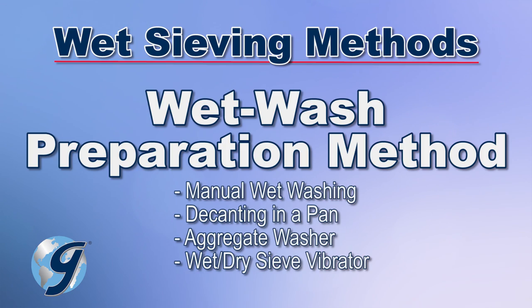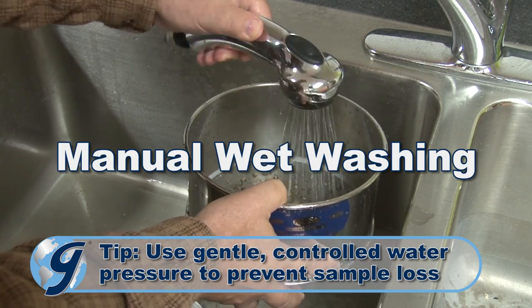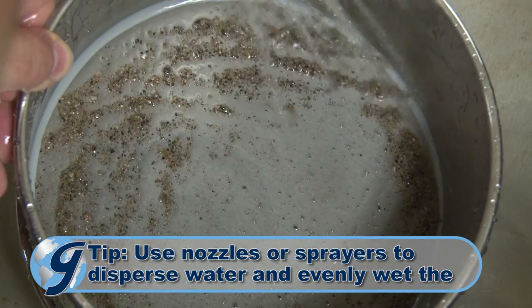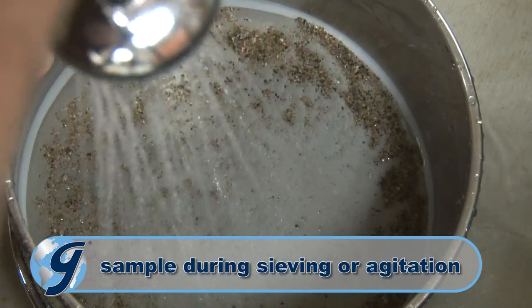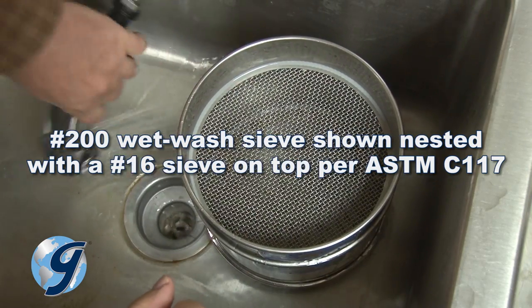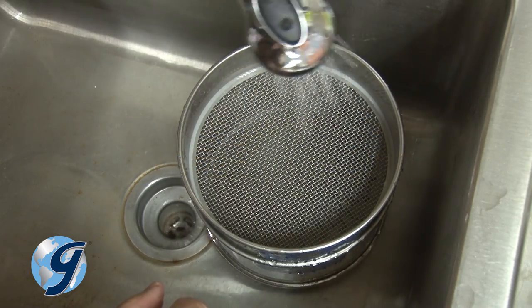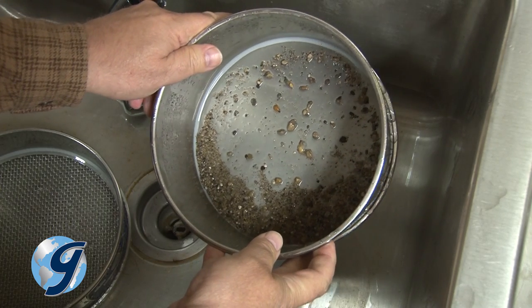The wet wash preparation method involves agitating the sample as it is sprayed with water or while it is in a water suspension. The agitation is often done by hand using a wet wash sieve under running water from a faucet or from a spray fixture. Mesh sizes for these sieves are selected based on application requirements. The number 200 and number 325 sieves are examples of popular opening sizes. An optional backing cloth reinforces the mesh for a longer service life.